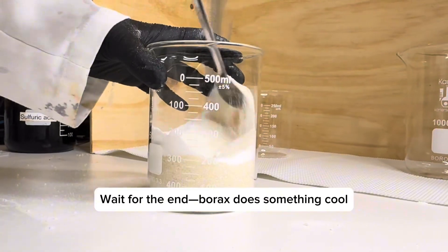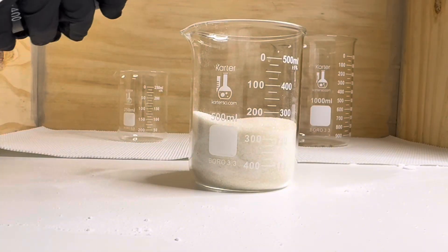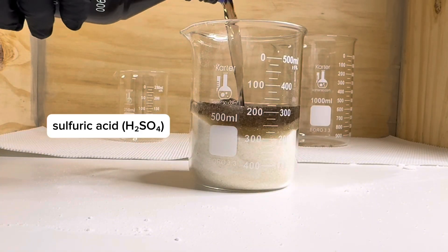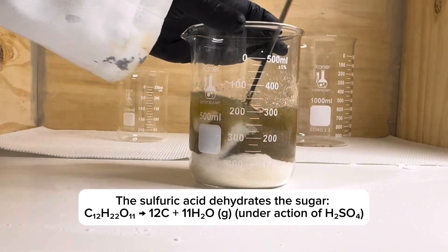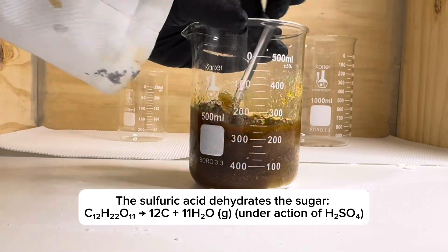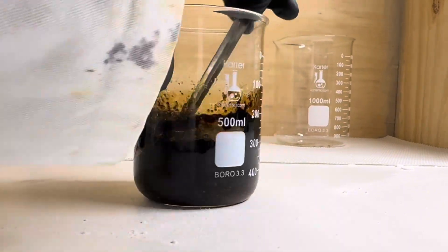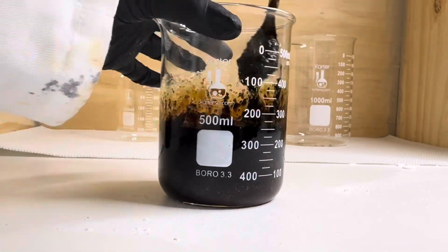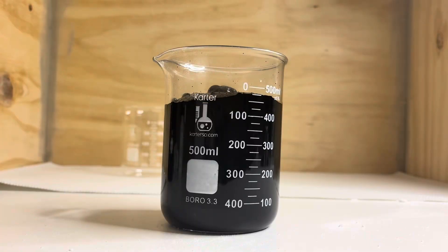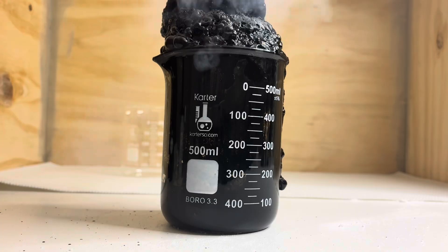Get ready for an exothermic reaction. Sulfuric acid is a powerful dehydrating agent — it pulls water molecules out of sugar, and the leftover material is almost pure carbon. The beaker is getting hot and should produce steam soon. Hot water vapor and gases push the carbon upward, creating a foamy carbon snake.